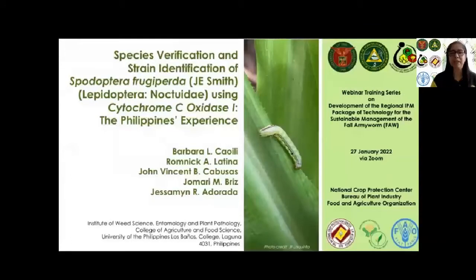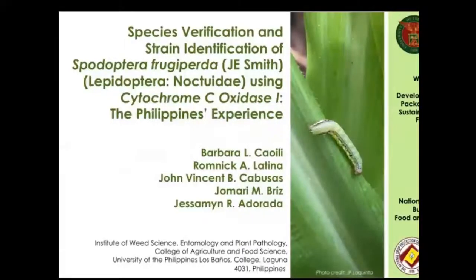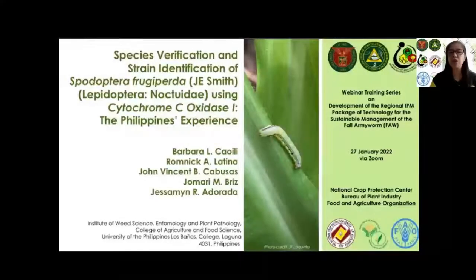So our team would like to thank the National Crop Protection Center, headed by Director Ebuenga, the DA Bureau of Plant Industry, represented by Dr. Yago and Chief Wilma Quaterno, and the Food and Agriculture Organization of the United Nations, headed by Dr. Hadley, for this opportunity to share our experience on the species verification and strain identification of Spodoptera frugiperda, commonly known as the fall armyworm, or FAW. I will be using those names interchangeably during the presentation.